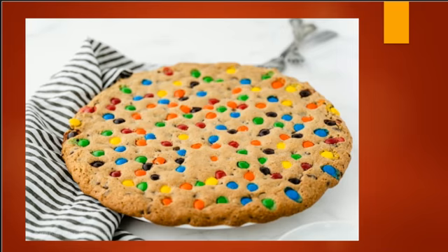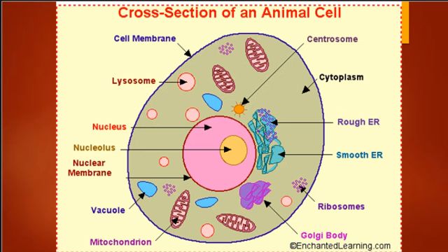Okay, we're going to be making a model of a cell for our lab, including, in addition to what you're doing there in the cup, we're going to make a model for our cell. And our cell, remember, looks like this. Okay? Are we drawing that? No. Is there a place to draw that? Yeah. No, on your lab sheet? No. We're going to do a special lab right now with this.